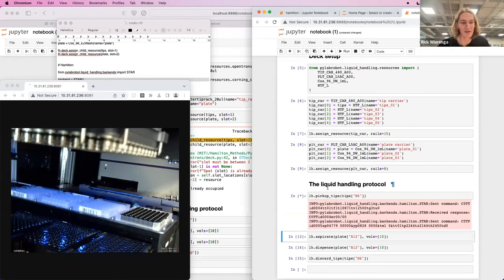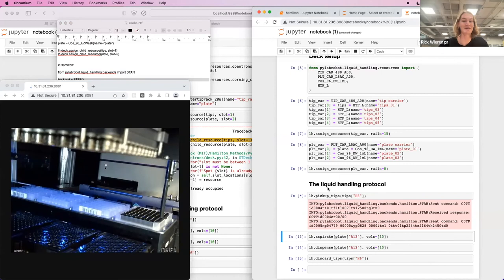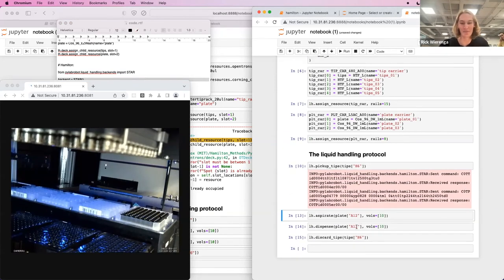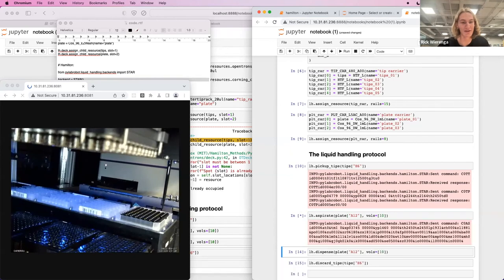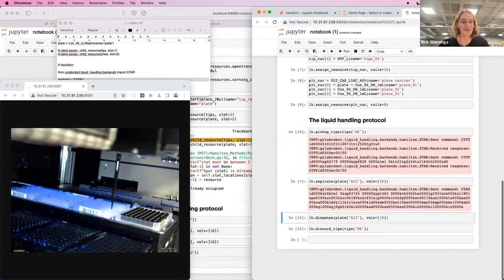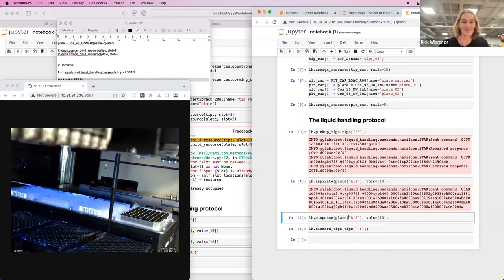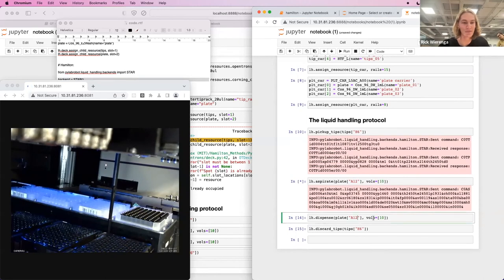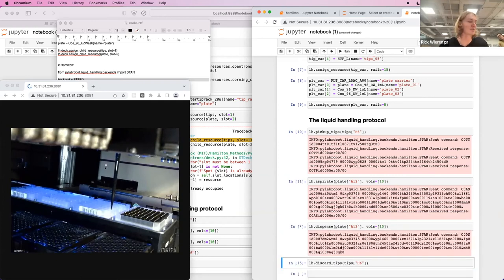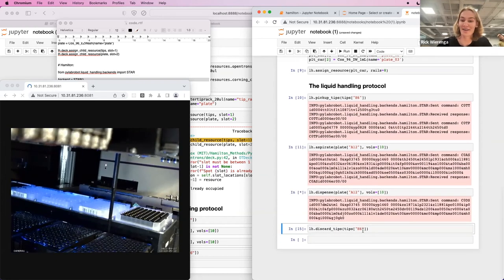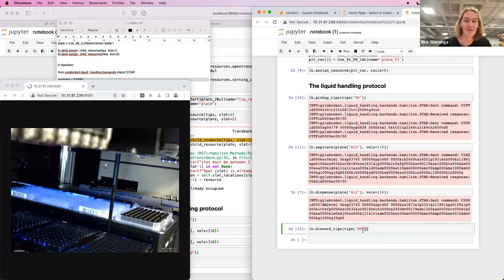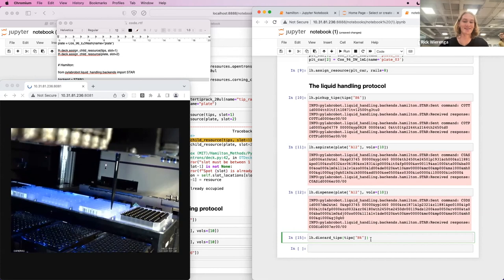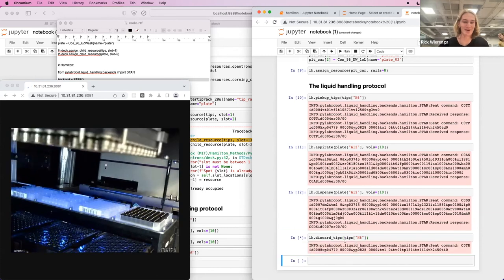And then we can pick up a tip remotely. Aspirate some air. And kindly put the air back again. And finally, discard the tip to the tip rack.